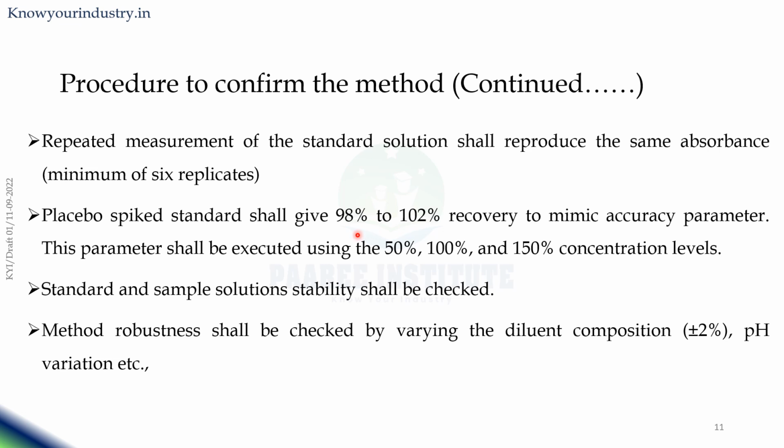Then the standard and sample solution stability also has to be checked. It means the fresh samples give the recovery. Then you keep the samples for hours or days, and again you check the absorbance and see the same recovery you are getting for the samples and the standards. Then your samples and standards are stable. So the stability of the samples also has to be checked.